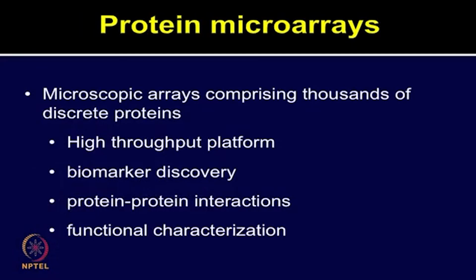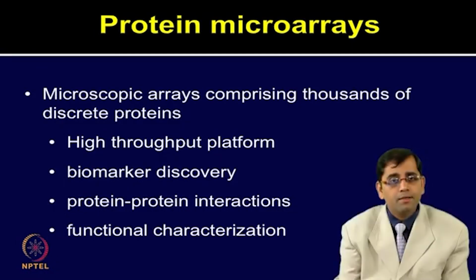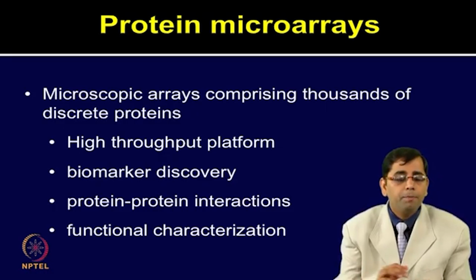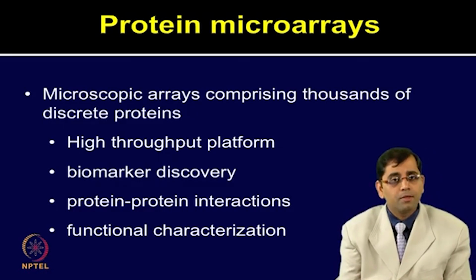The success of genomic technologies such as DNA microarrays has motivated the development of protein microarrays. Protein microarrays are microscopic arrays which comprise thousands of discrete proteins printed on the chip surface.